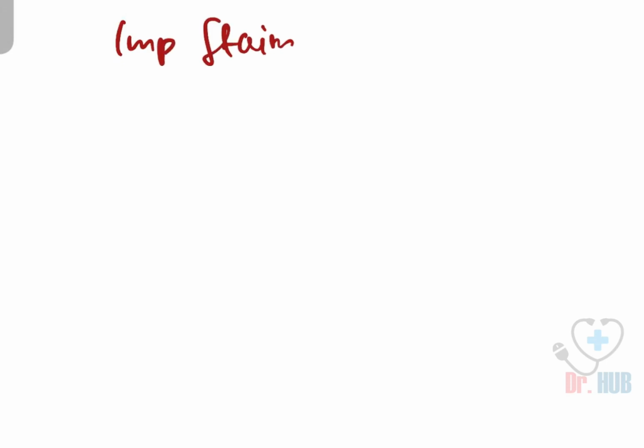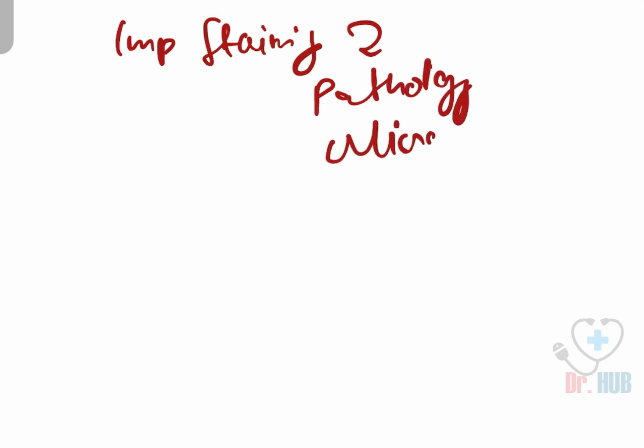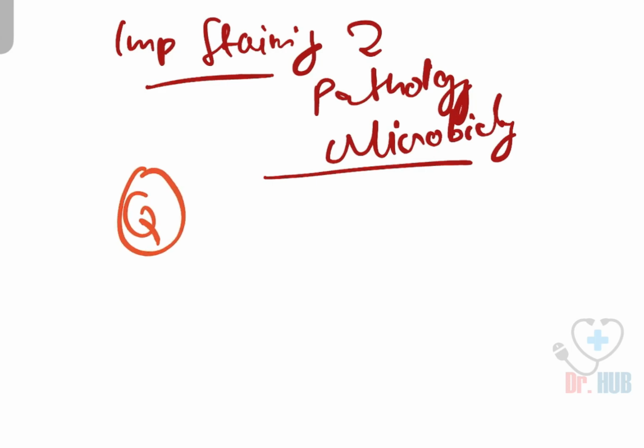Important stainings in pathology and microbiology. Firstly, we are going to look at some questions. Where is the H&E stain used?